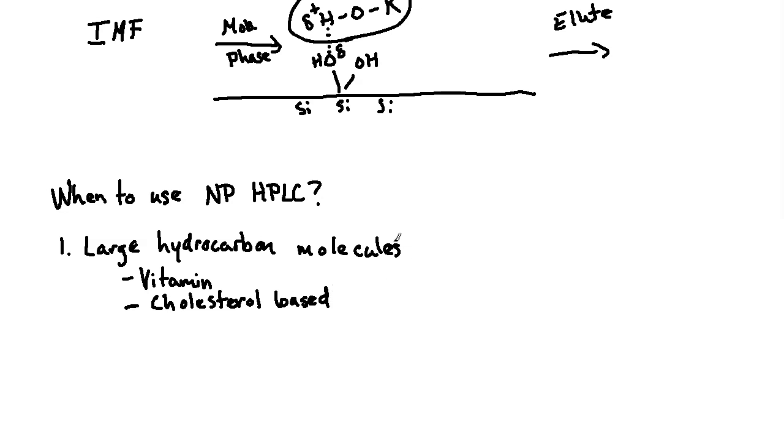But the key is, if you've got large hydrocarbon molecules that primarily have a lot of CH groupings, okay, you're kind of steering away from a lot of the oxygens, the nitrogens, especially if those groupings have hydrogens on them. So hydroxyl groups or alcohols, amines, now you're starting to get pretty polar, right? And so this will generally be a good method for separating these types of compounds.